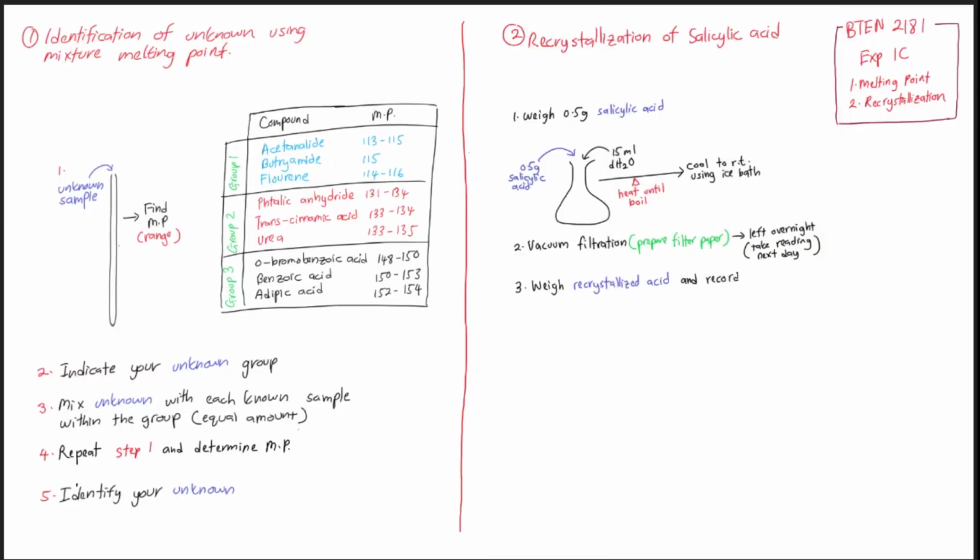So the plan is like this. As you see before, you take 0.2 or 0.5 gram of that acid, and then you put it into a flask, and then after that you add the hot water. You don't put water first and then you boil. This is quite wrong here. You add the hot water, because when you boil, your sample will splash here and there.